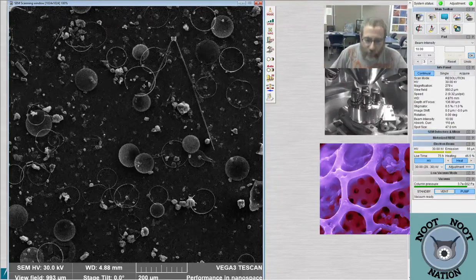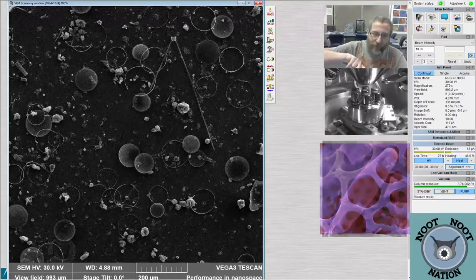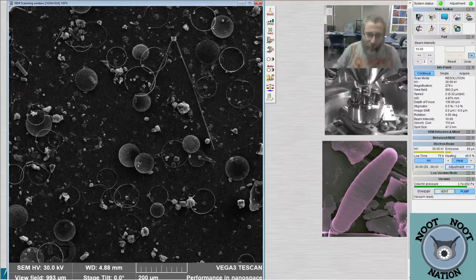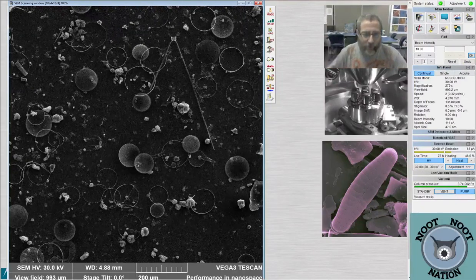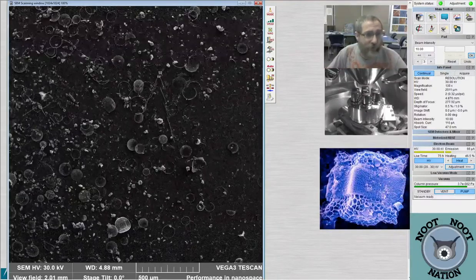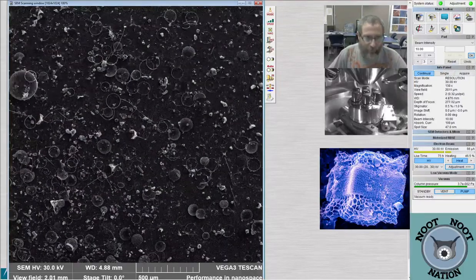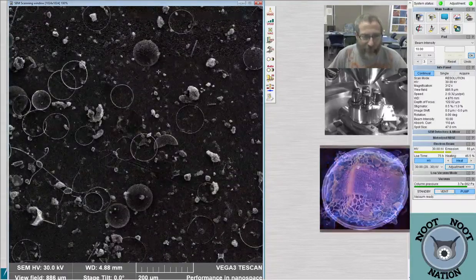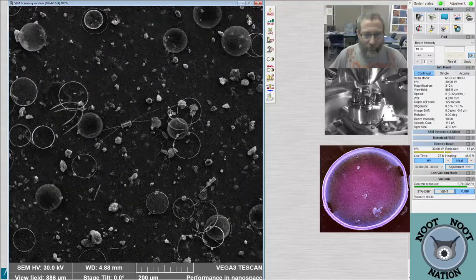But if you took each one of the raphes that would normally be meeting in the center, they would have to be pushed all the way up to one margin and then wrap all the way around the outside. So they have an end on each side that joins together and a start on each side that joins together. And you could theoretically, if you could see them, figure out which one was the proximal raphe versus the distal raphe. Although I don't know about the terminology, whether they actually call them that, but you should be able to tell.